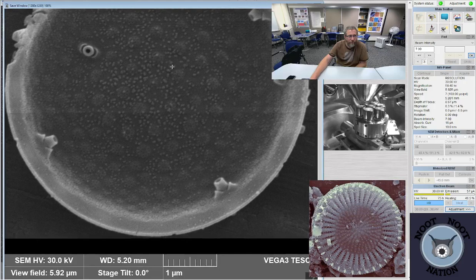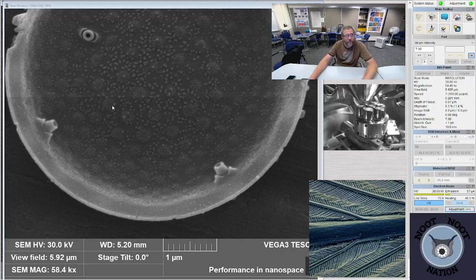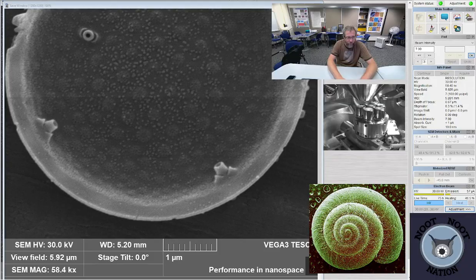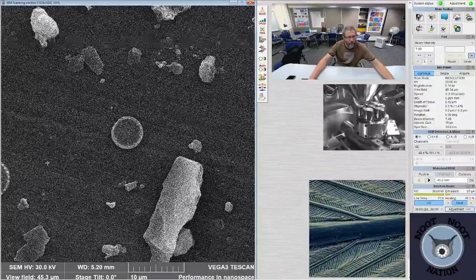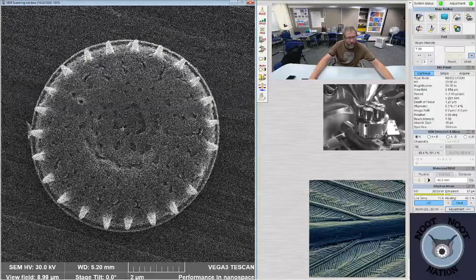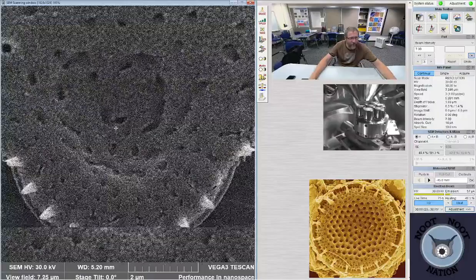Not really seeing the Cyclostephanos at all yet. It's just an internal view of a little stuff. Also, it's sort of charged up a little bit, which is weird. I think the one that we were looking at was the internal view, and I think this is its external view. Whatever this is, I think it's Rugosa, maybe, or something kind of related to it. But I think this is probably the external view of that diatom.